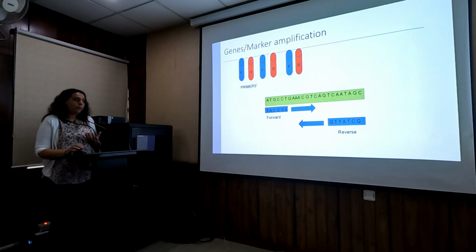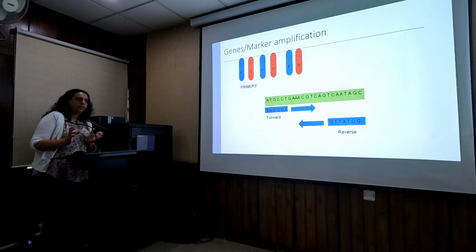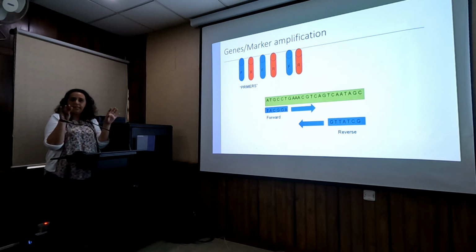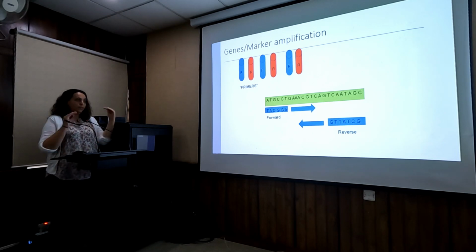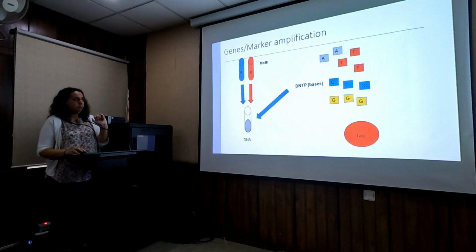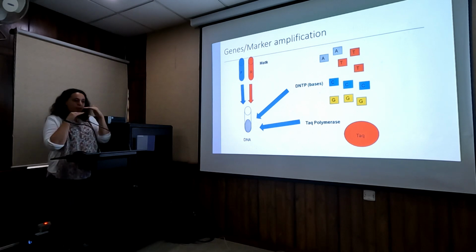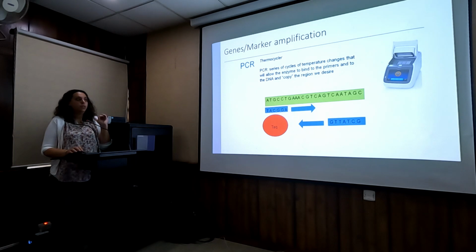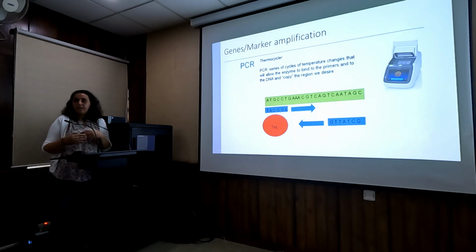So you need your primers, which are small sequences that are going to tell the enzyme which part of the DNA you want. So like little flags that it's going to go direct into the DNA and say, here, this is the part that I want to copy and not anything else. And usually there's a forward and a reverse. You add the forward and the reverse sequences of your primers, the little flags. You add lots of bases, A, T, C, Gs, and you add your enzyme. You put it into the thermocycler, and through a series of cycles, it's just going to keep copying that region over and over and over again. So if it's 30 cycles, it's going to do that 30 times.